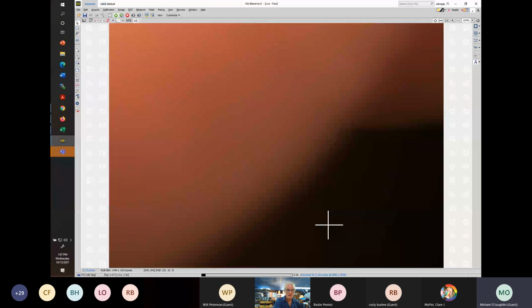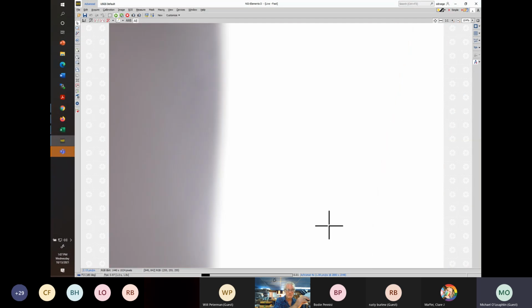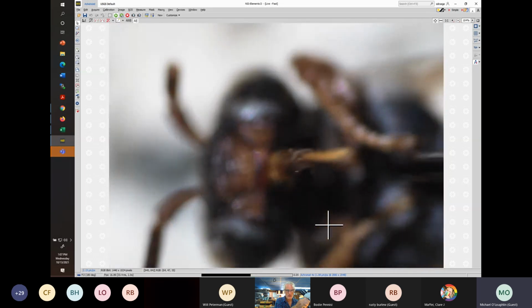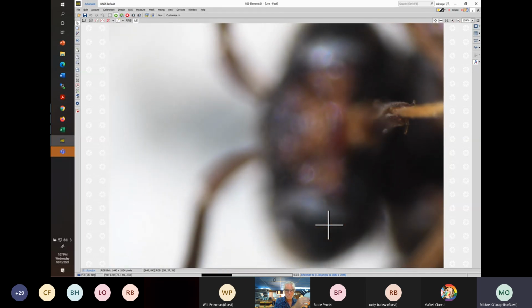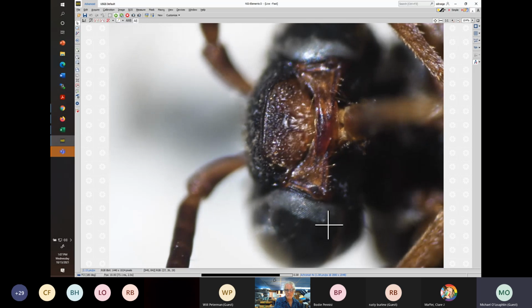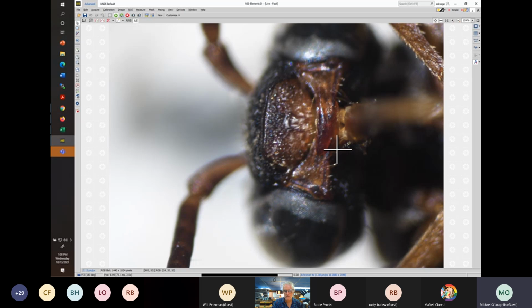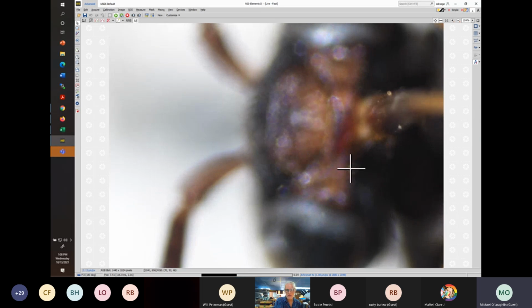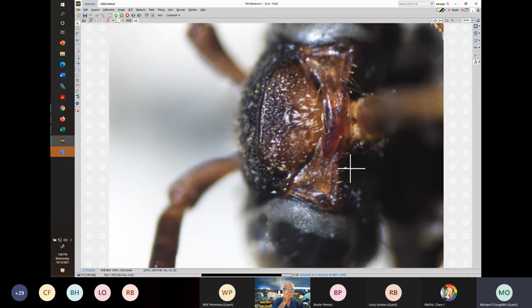I'm going to flip it, stick it into the clay via its tip, take the magnification back down, and then we're back up. Okay, so you can see the mandible here, and indeed the outline, which I'm sketching here, has no additional tooth on it. Again, I don't want to be absolutist about this. Someone else may know whether that's always a tooth versus not tooth a way to tell the males apart.